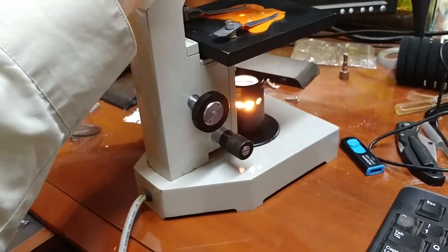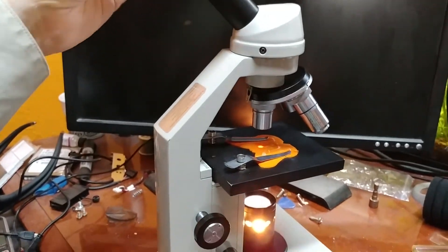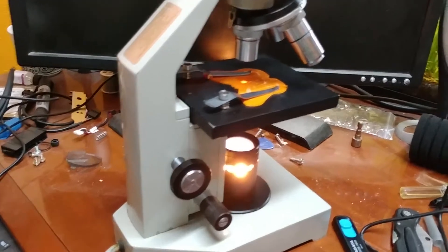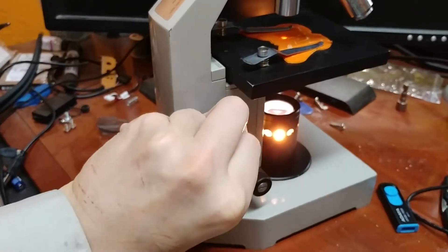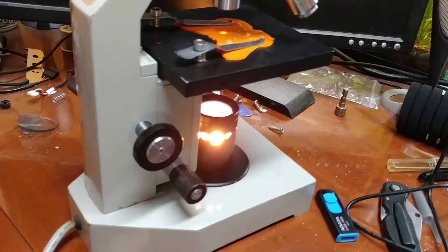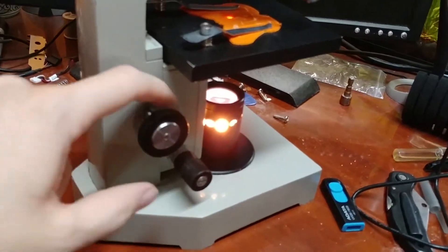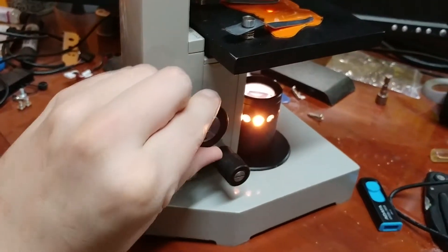Hi everybody. Today's weird project is a DIY digital microscope. I picked up this classical style microscope on eBay for $18. It had some issues — the adjustment knobs didn't move, this thing was completely frozen. I ended up having to take the whole thing apart and actually hammer these sections apart in order to shim the metal plates that had gotten stuck and get everything working again, re-greasing it.